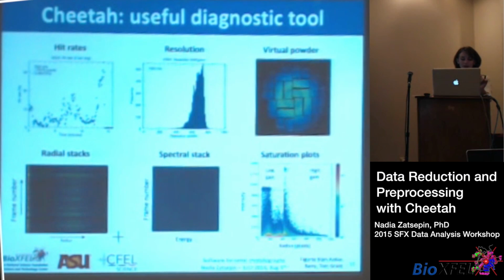One row is one diffraction pattern's radial average. You can see the fluctuations. This could be due to, of course, the sample, or just the thickness of the jet in the line of the X-ray beam. And that's involved with the incoming intensity that, remember, fluctuates as well from shot to shot. You can also have a recording of the spectrum of the X-rays as they're coming in, if the spectrometer is online.